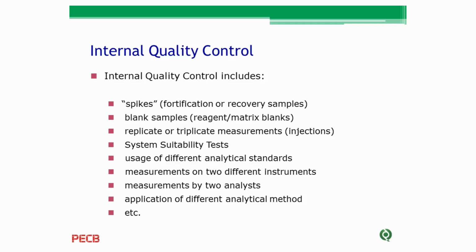Sometimes we compare two different instruments together. In large laboratories, sometimes we have different equipment for the same purpose. So we should have a system in order to compare the outcome of all the instruments and to check if they are not significantly different from each other. The same story for the analyst or for different methods which might exist in a laboratory.